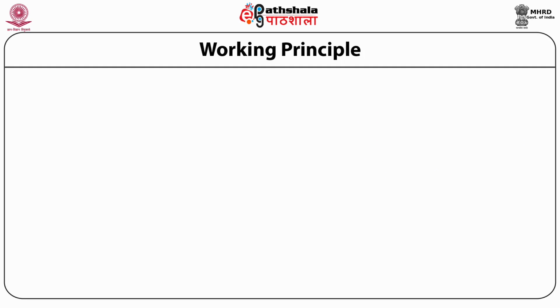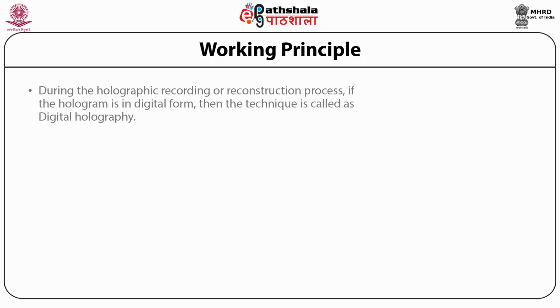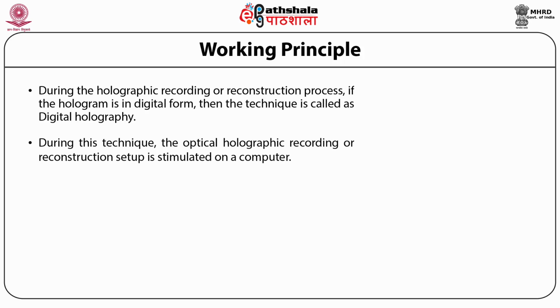Let us next discuss the working principle of holography. During the holographic recording or reconstruction process, if the hologram is in digital form, then the technique is called digital holography. In this technique, the optical holographic recording or reconstruction setup is simulated on a computer. Figure 4 shows schematics of the process.